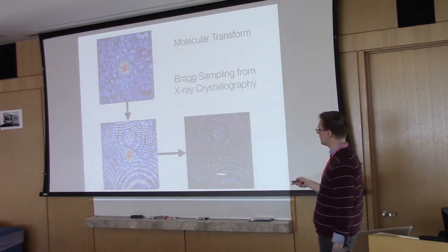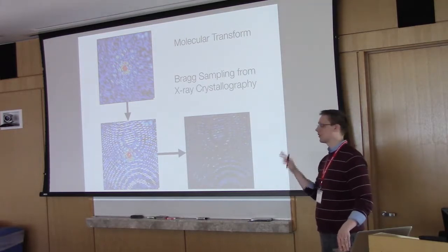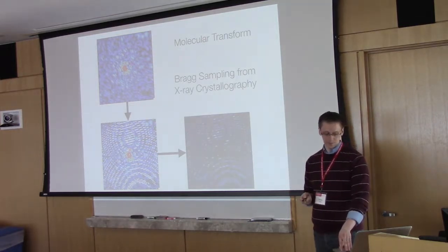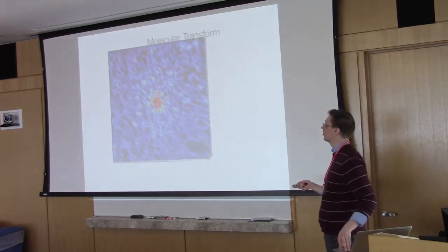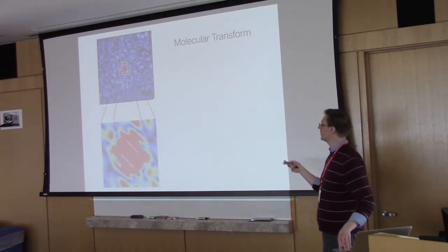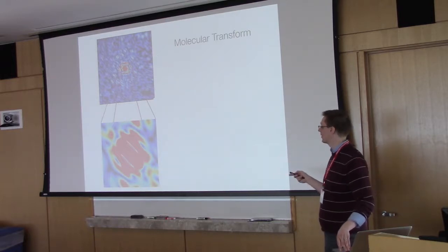Okay, and so this information is what you actually get when you're looking at crystallographic reflections. And building this up in 3 dimensions allows you to go ahead and solve the structure. The same basic physics applies to solution scattering, where we start with our molecular transform, our single molecule diffraction. But because we're doing small angle scattering, we're just going to look at this bright blob at the center and not be concerned with these wider angle scattering terms.